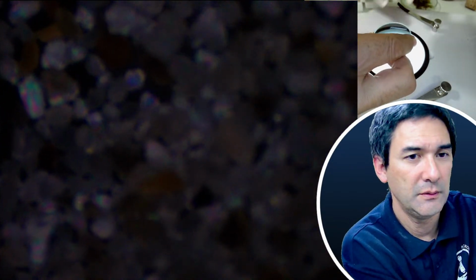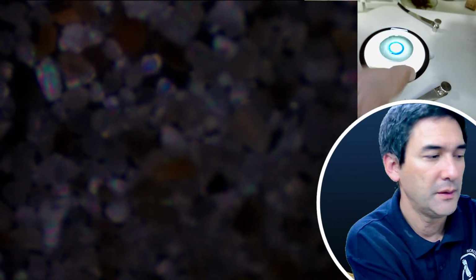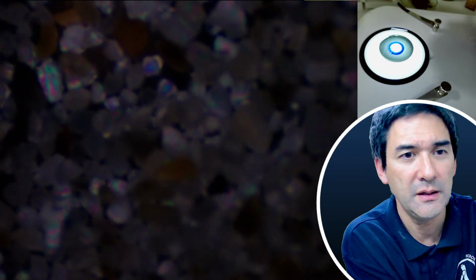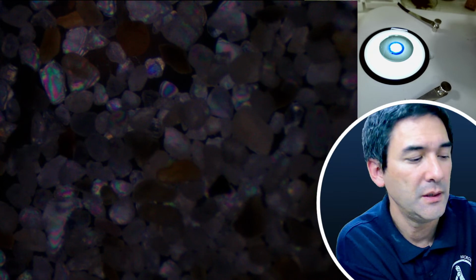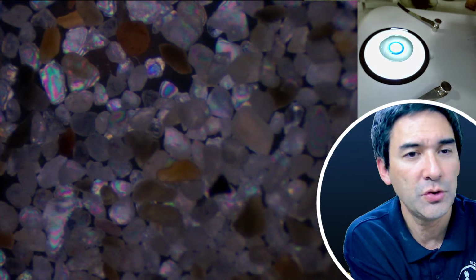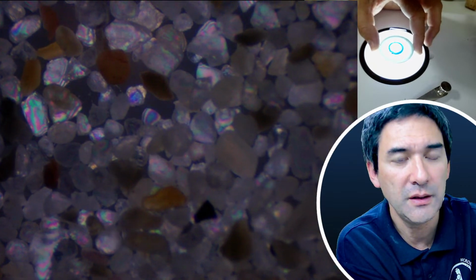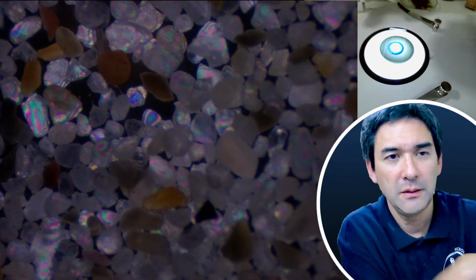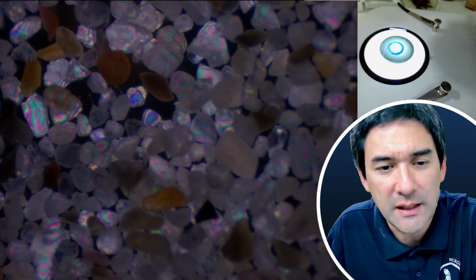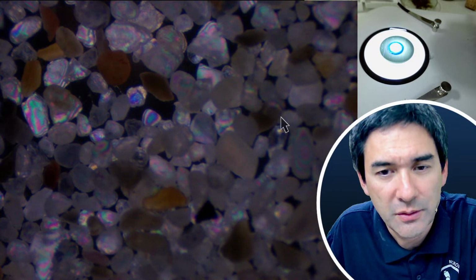And we have to go up a little bit with the intensity. It's very dark, but you're going to notice something. Everything's much darker, but the really interesting thing is, most of you are going to say, well, it's not so special, but there are a couple of sand grains that actually have rainbow colors. And that's what I'm interested in.